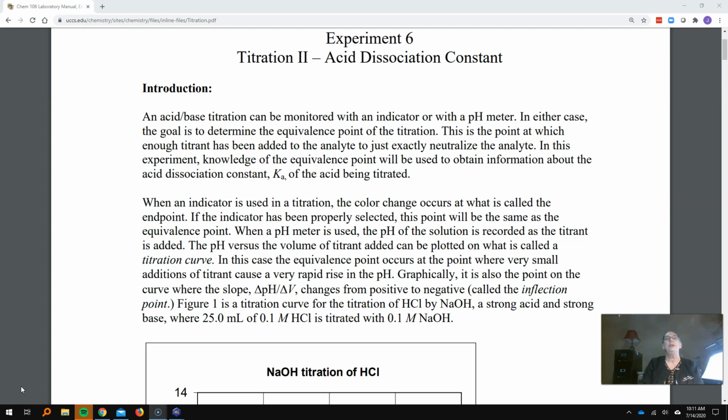Okay. So we always have a titrant, and that's going to be sodium hydroxide. That's a strong base. We always have something we're titrating to see its concentration. So in that case, when you do that lab, it will be acetic acid, which is vinegar, and you'll have an indicator in there. When you do the lab yourself, it will be phenolphthalein, which turns from colorless to a pink color. It's a really quick change, so it's really helpful when we're doing that lab.